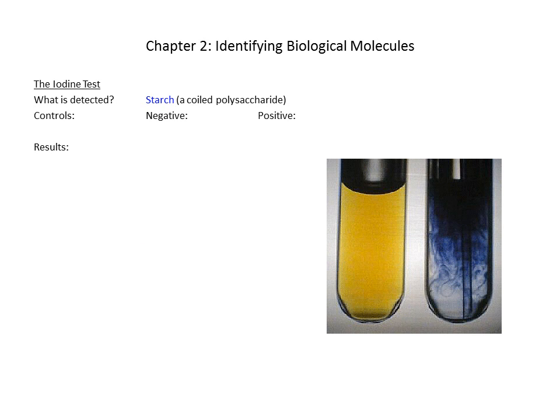Okay, test number 2, the iodine test. We discussed this earlier, but remember that coiled complex carbohydrates such as glycogen or starch will take iodine out of solution, iodine that's in solution as an ion, so potassium iodide, and it will remove it as iodine 2 by wrapping all those complex carbohydrate arms present in this one molecule of starch or glycogen around the iodine and just dropping this precipitate.